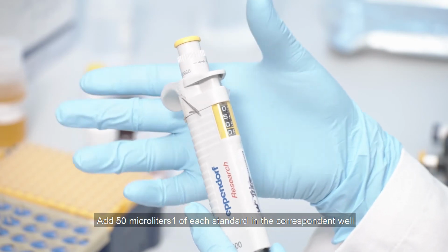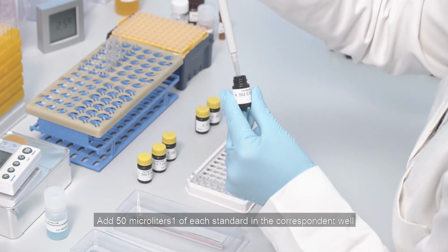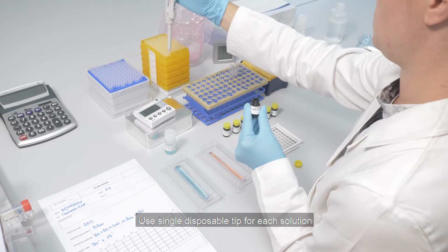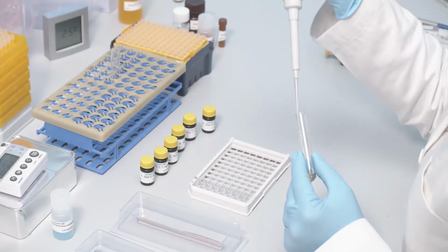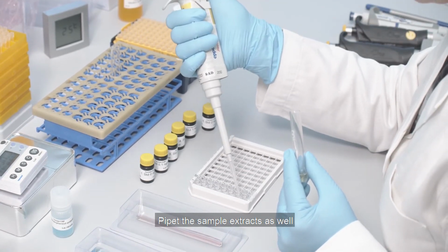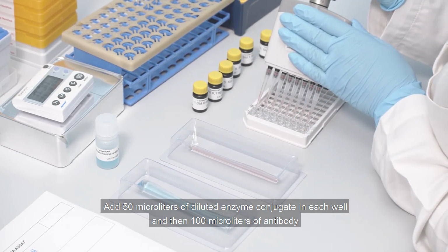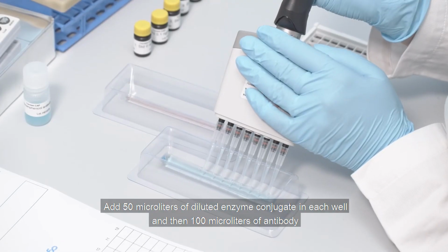Add 50 microliters of each standard in the correspondent wells. Use a single disposable tip for each solution. Pipette the sample extracts as well. Add 50 microliters of diluted enzyme conjugate in each well and then 100 microliters of antibody.